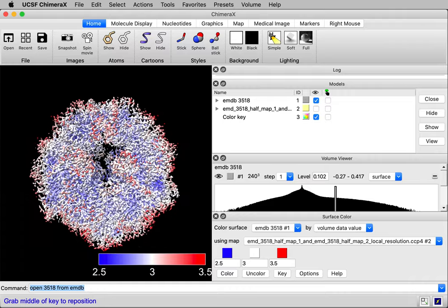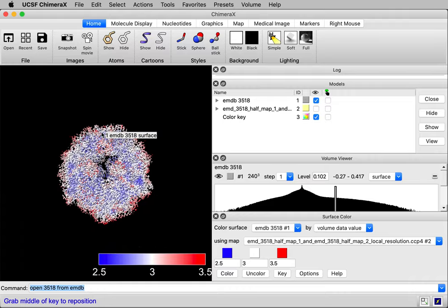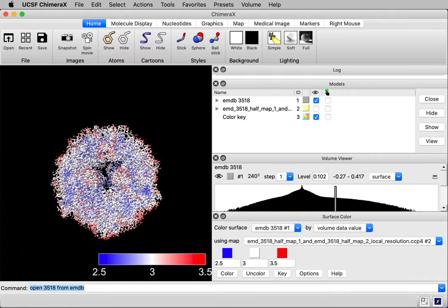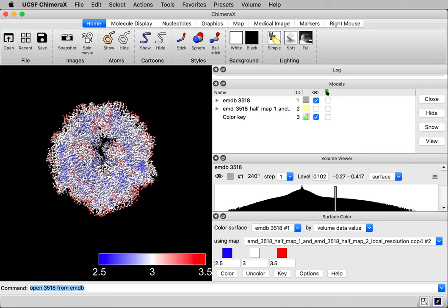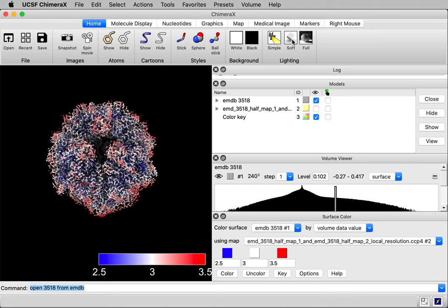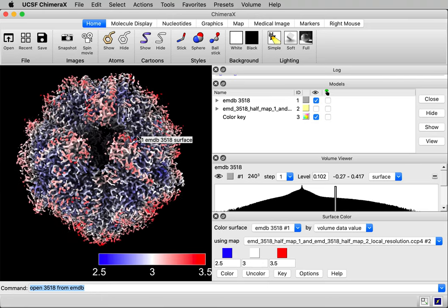And let me make this look a little more beautiful. I'm going to change the lighting to be the soft lighting.